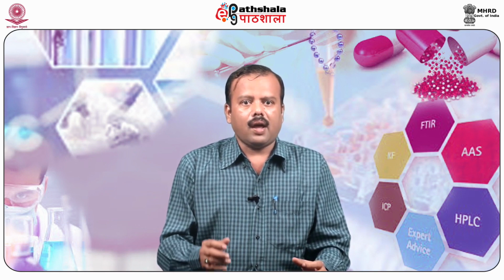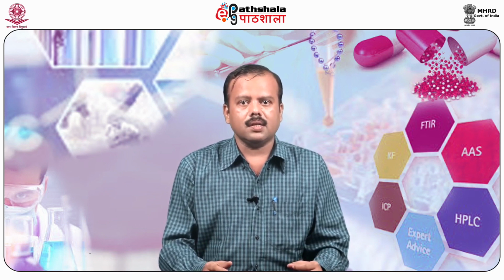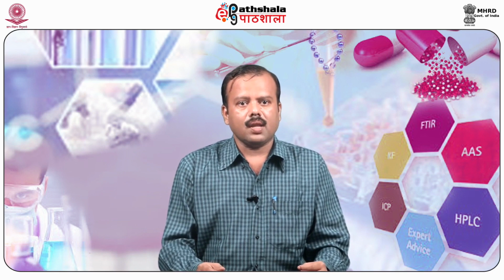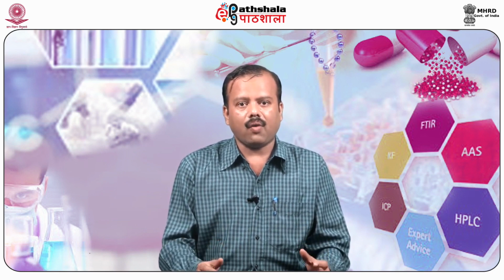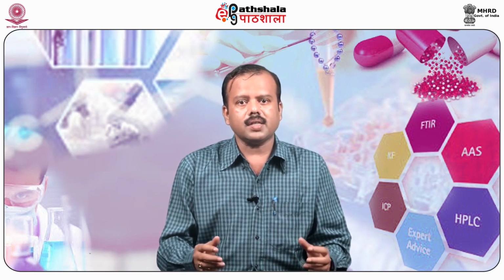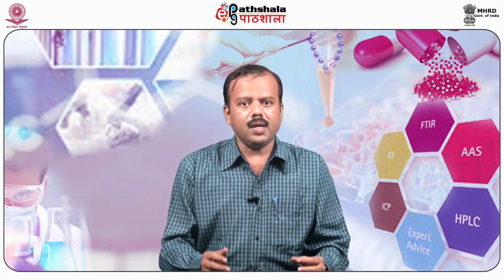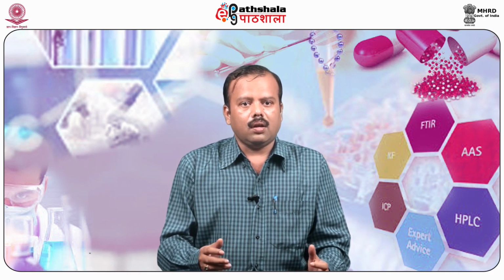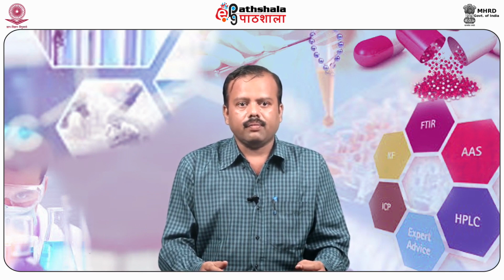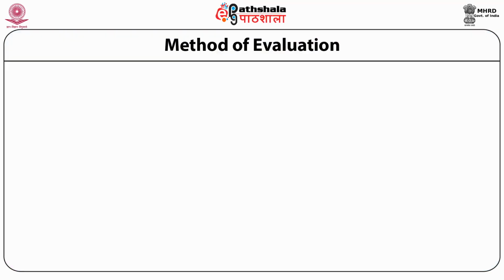Number 4, to determine the efficacy and limitations of new antimicrobial substances. Nowadays, before marketing any new antimicrobial substance, the manufacturer carries out a series of proving tests that include the phenol coefficient test, the minimum inhibitory concentration for a range of microorganisms, the effect of organic matter, and acute and chronic toxicity.